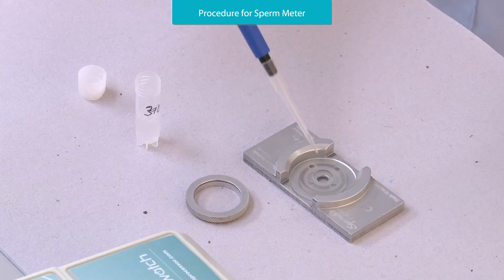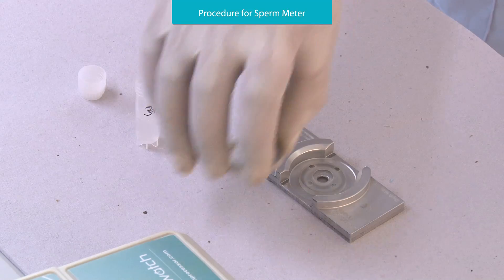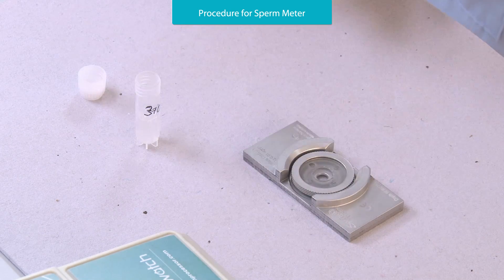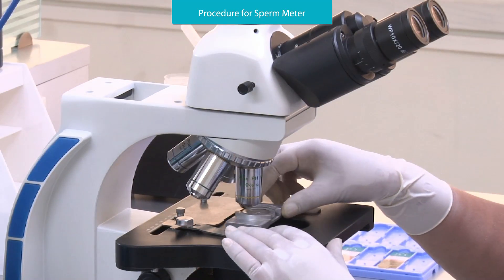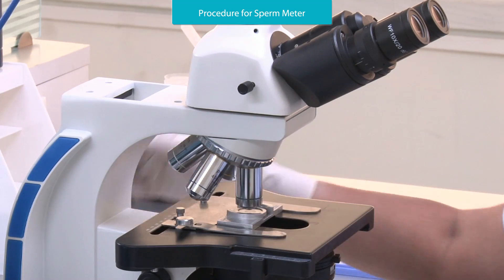Place 10 microliters of the mixture onto the sperm meter optical window. Put a cover glass with grid on the sperm meter. Observe 10 squares under the microscope using a 20x objective lens.